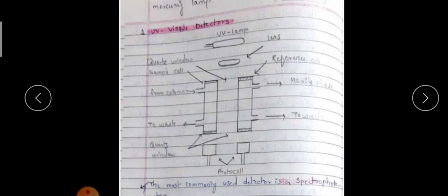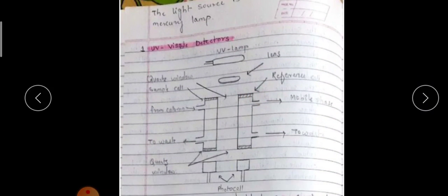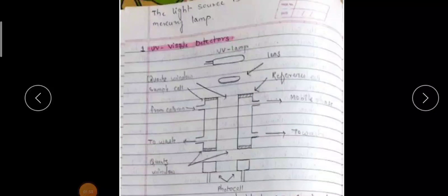Then you can see the eluent from the column is passed to this sample cell. Then whatever the processed material, it will go to the waste. You can see here from the reference cell, the mobile phase is there. Then the processed mobile phase is given back as a waste.